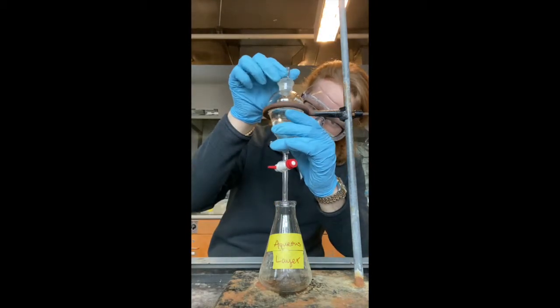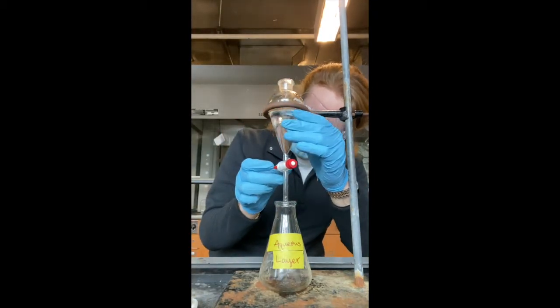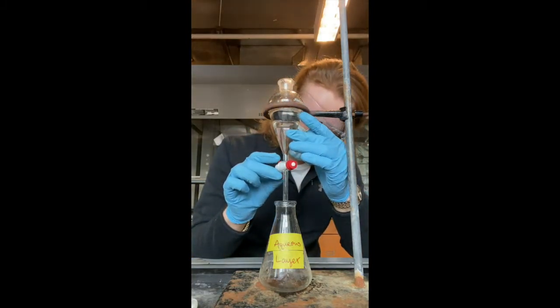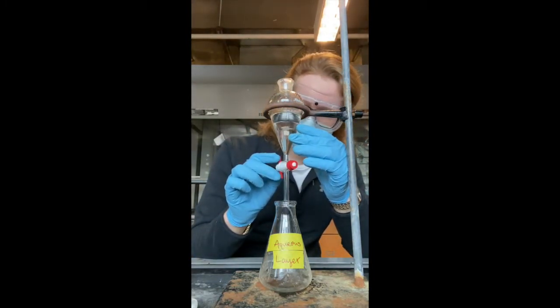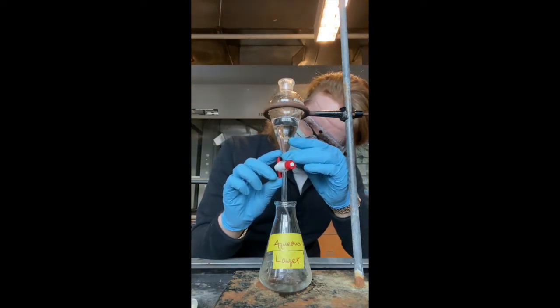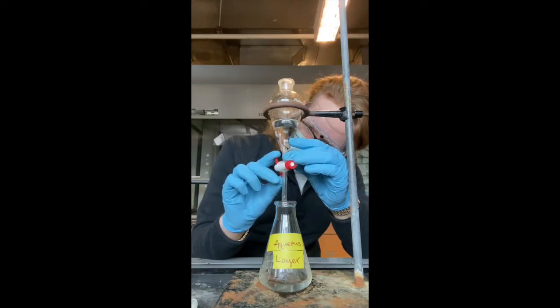Now, for the final step in this liquid-liquid extraction, you will once more proceed with the draining of the aqueous layer and the pouring out of the organic layer. Just as before, you will take out the glass stopper to drain out the aqueous layer into its Erlenmeyer flask, stopping right at the meniscus to ensure that none of the organic layer is drained out of the bottom, and then finish by pouring out the organic layer from the top of the separatory funnel into its Erlenmeyer flask.